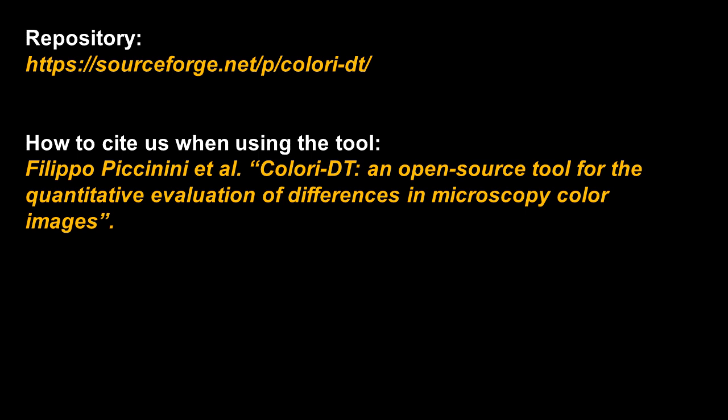Then please, when using the ColorI DT tool, cite our scientific article. The title is ColorI DT, an open source tool for the quantitative evaluation of the differences in microscopy color images, and the first author is Filippo Piccinini.